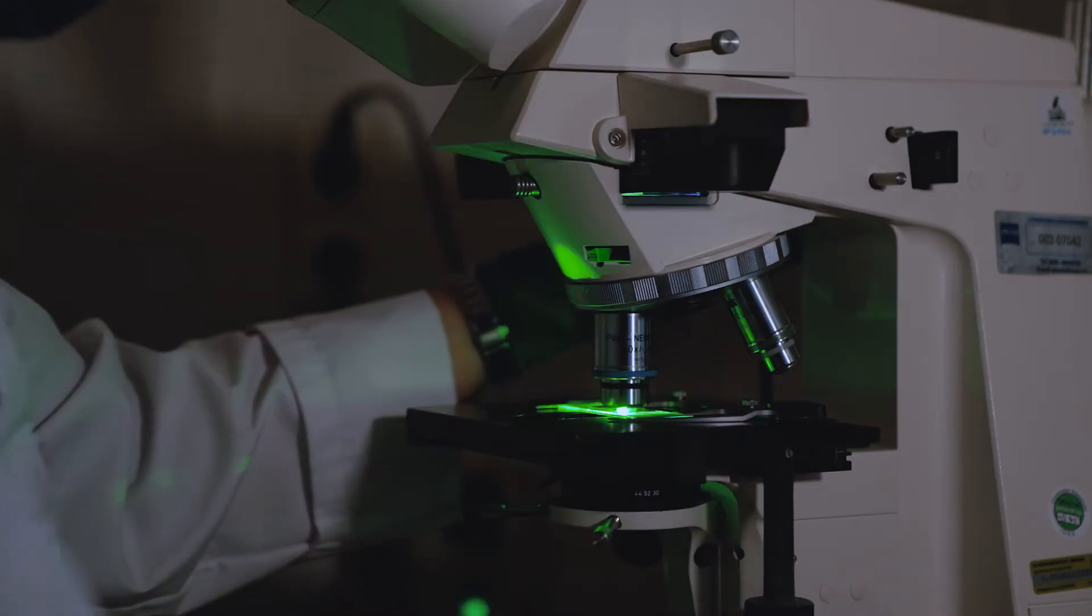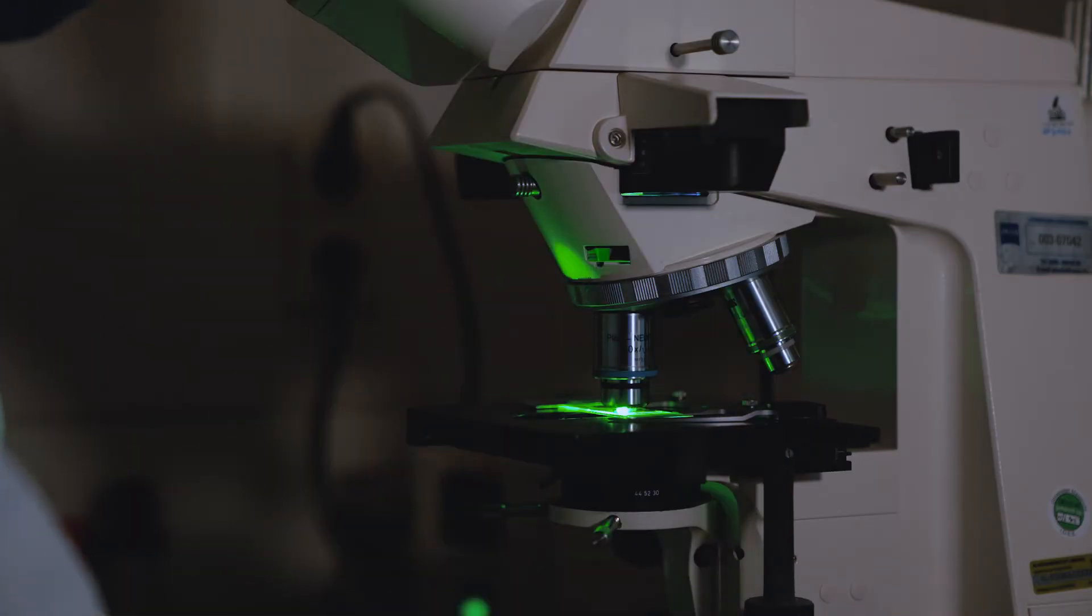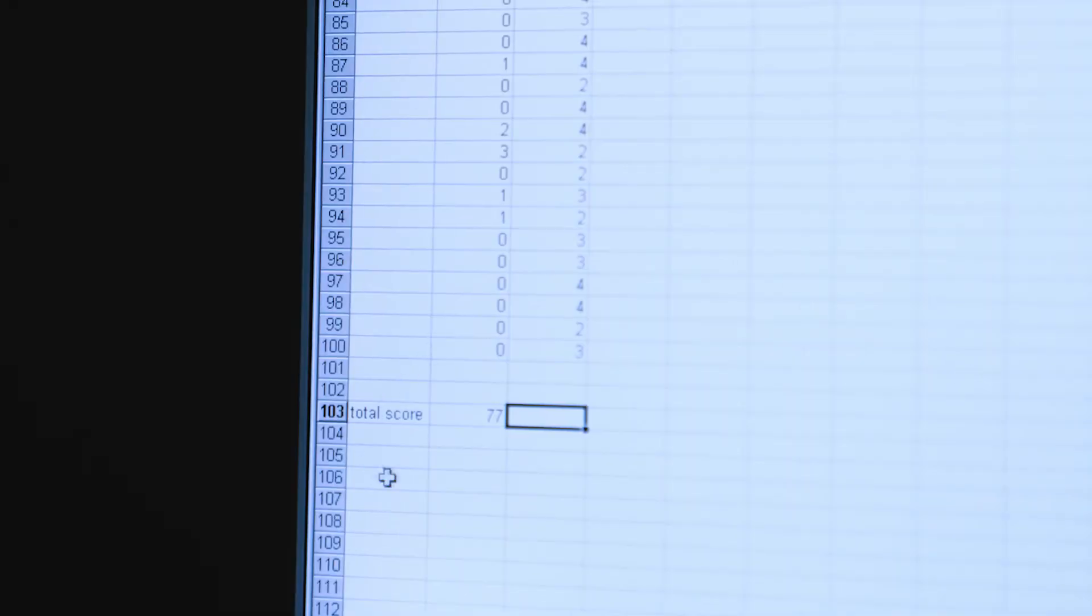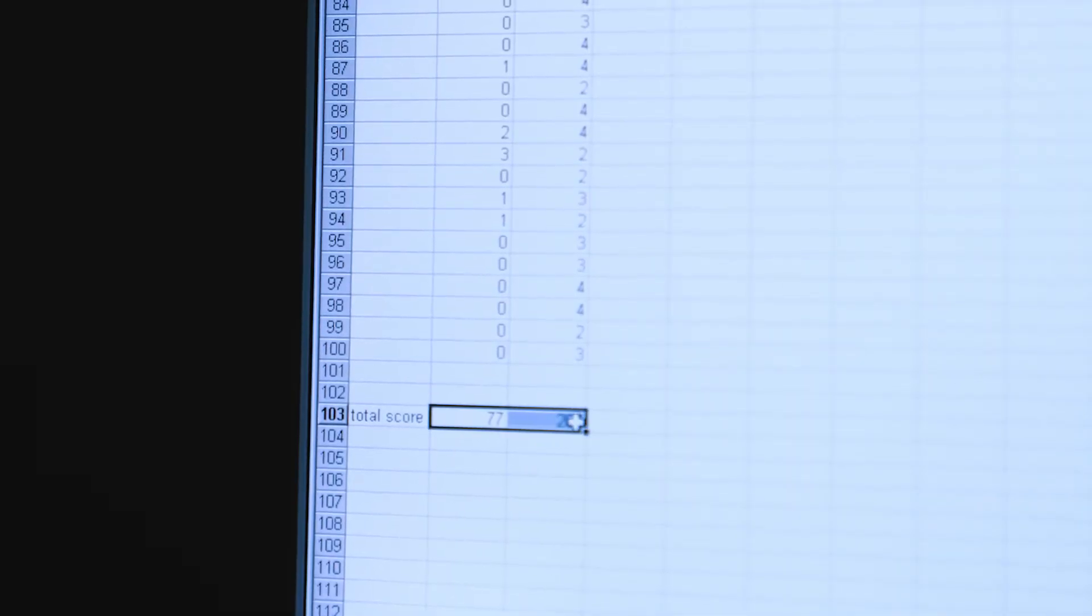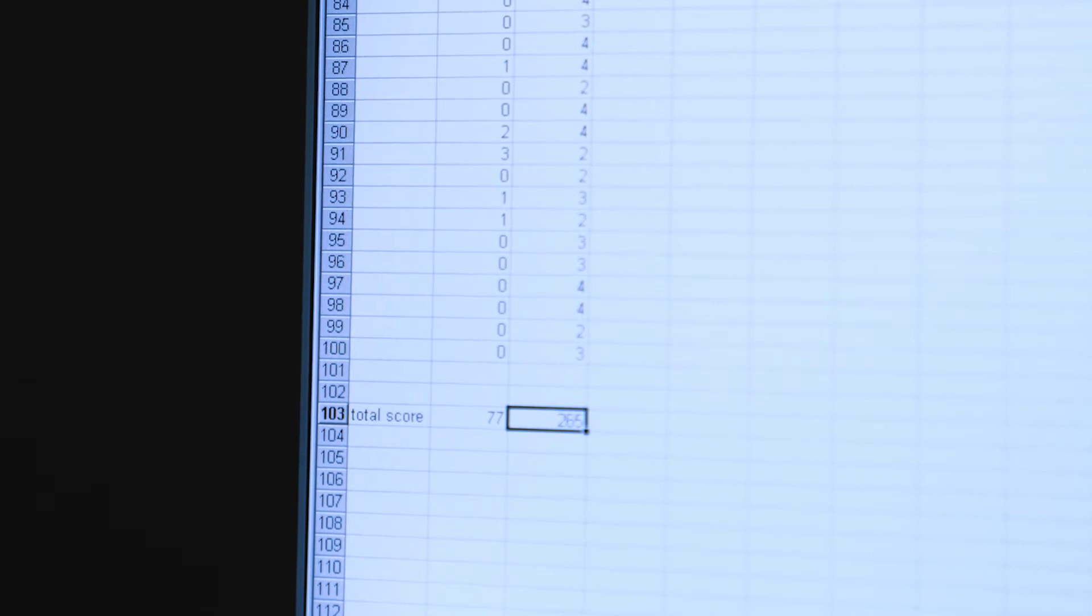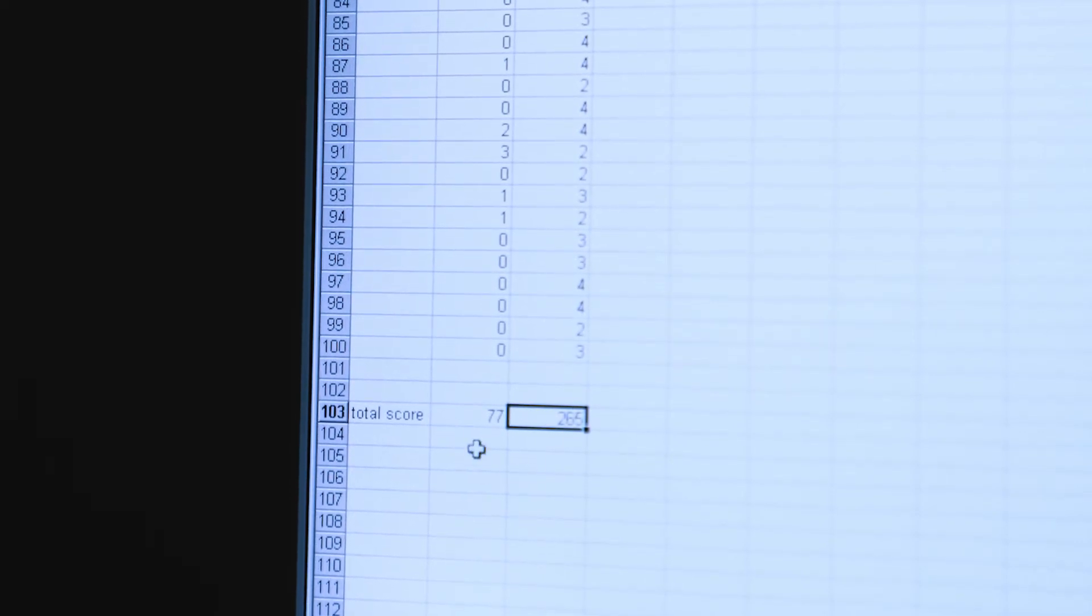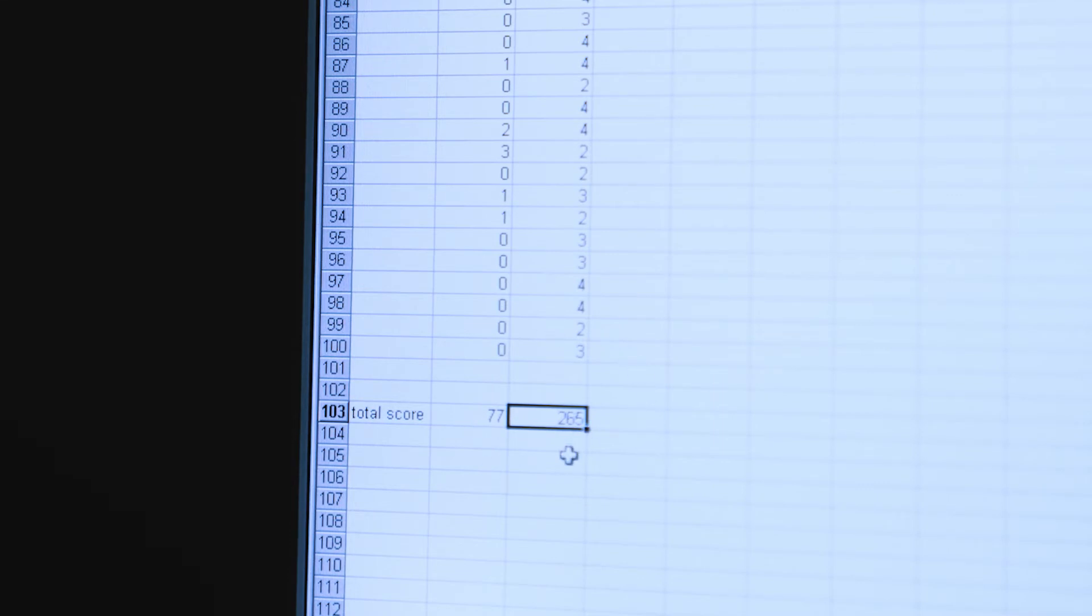You see that this can be done simply in Excel. You can look through the microscope at your comets and at the same time type in the number that corresponds to the class of comets that you're viewing. So when you've scored 100 comets you can simply calculate the sum of your 100 comets. In this case you can see that the first sample had a low level of damage and the second sample has a higher level of damage.